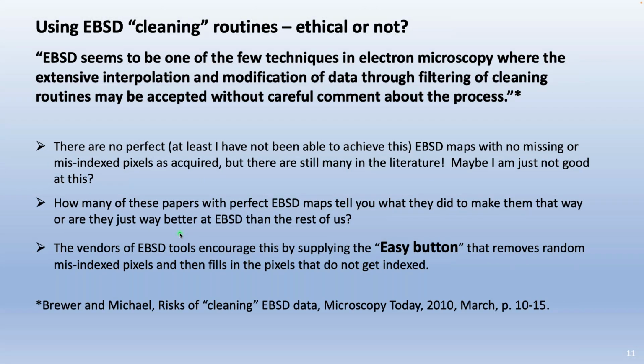This is a reference to some of the early work that Luke Brewer and I did, talking about the risks of cleaning EBSD data. It was published back in 2010. One of the statements from that paper is that EBSD seems to be one of the few techniques in electron microscopy where extensive interpolation and modification of data through filtering and cleaning routines may be accepted without careful comment about the process. And some things I noticed from the literature.